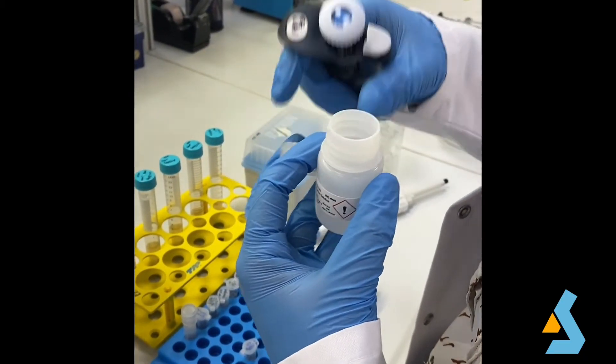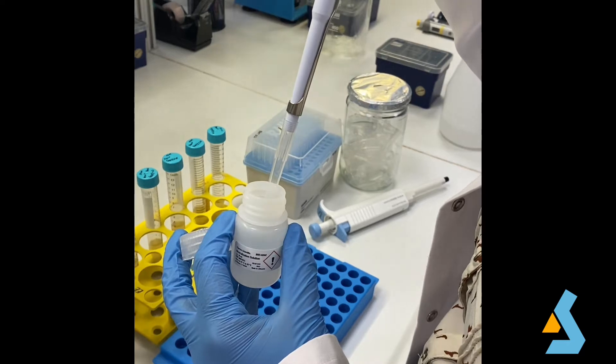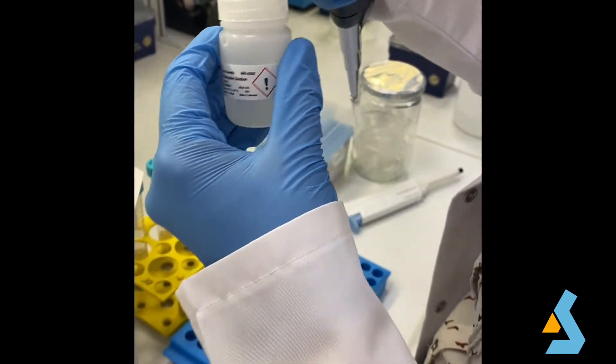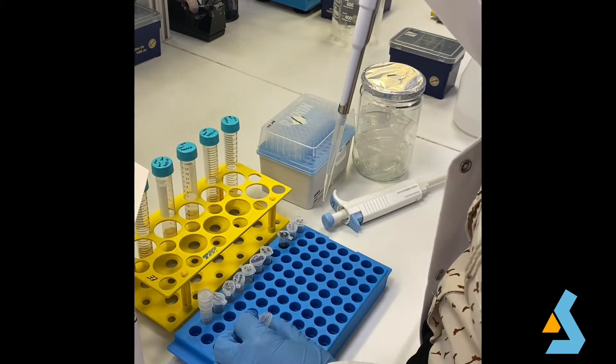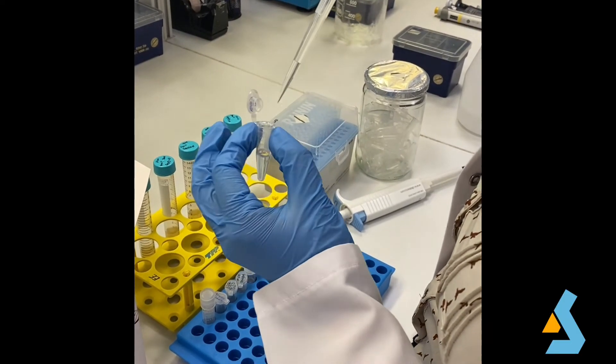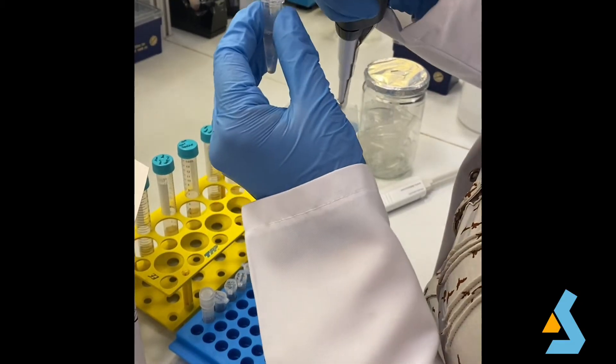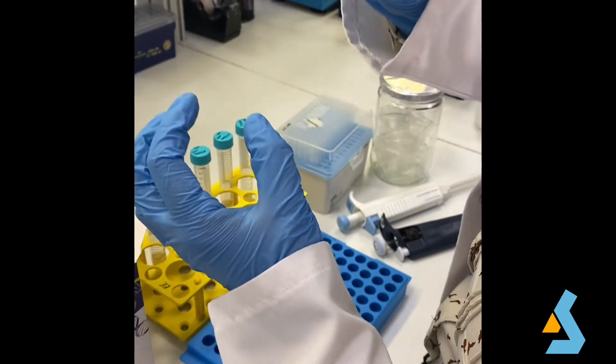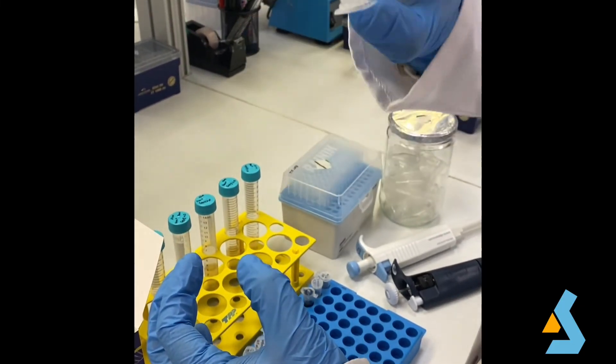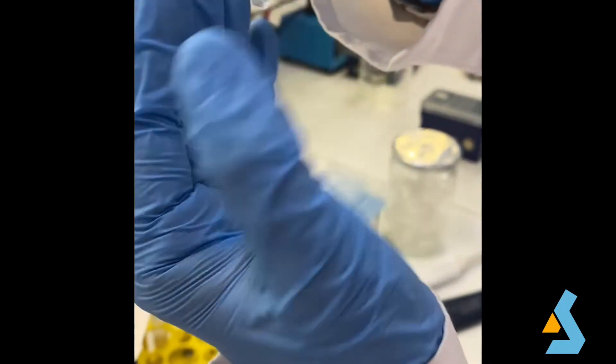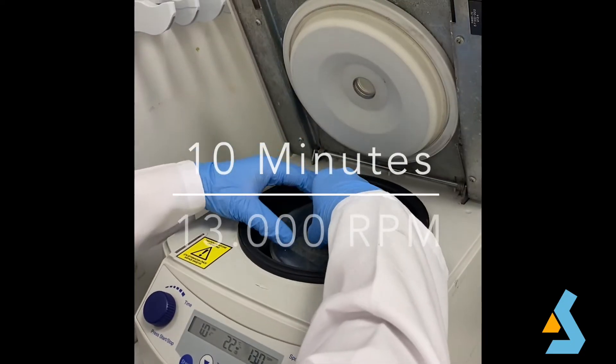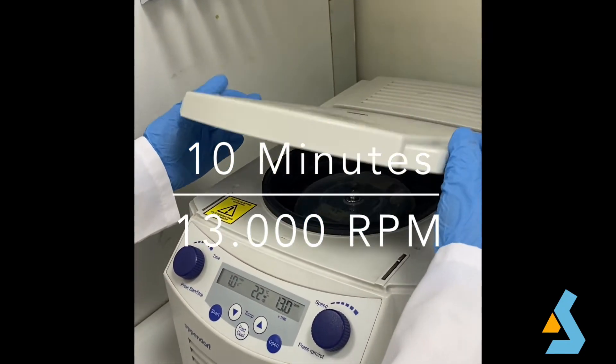Then 350 microliters of neutralization solution is added to the cell suspension to allow binding of plasmid DNA onto the silica membrane in the spin column. This buffer contains sodium ions and it neutralizes the negative charges on the DNA molecules, which enables DNA to bind to the silica membrane. For this, we must mix immediately and thoroughly by inverting the tube four to six times. The bacterial lysate should become cloudy. The tube should then be centrifuged for 10 minutes to pellet the cell debris.